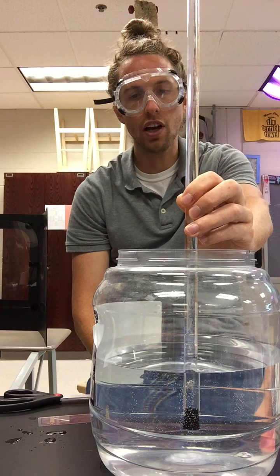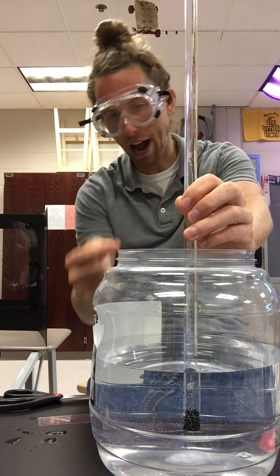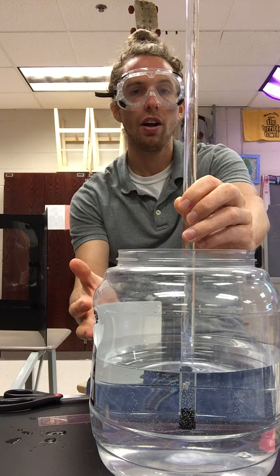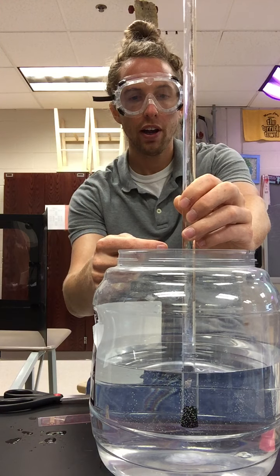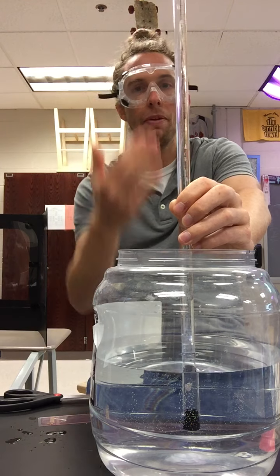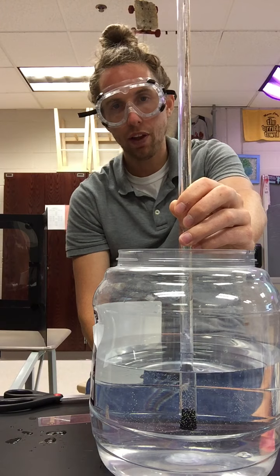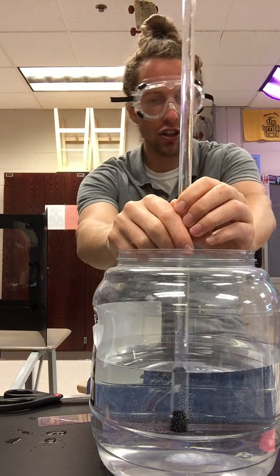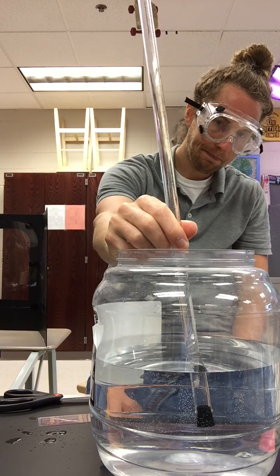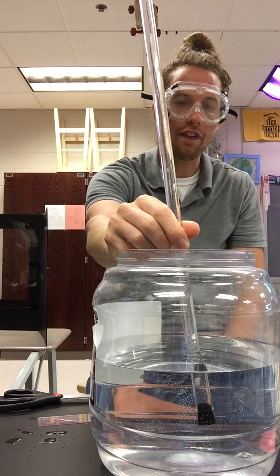And as they rise towards the top, they have to force something out because of pressure, and they're forcing water out through the bottom of this eudiometer tube. Now, it's really important that we're doing this underwater because as the bubbles are forced out, if I just did this out in the air, we wouldn't be able to measure the gas, right? It would have no reason to go up in this tube. So because it's less dense than the water, it's forcing water out while it goes up. And so we're seeing this reaction take place. It should get more vigorous as the acid gets lower in the tube. And we ultimately want to measure the volume of gas that's given off in this reaction.